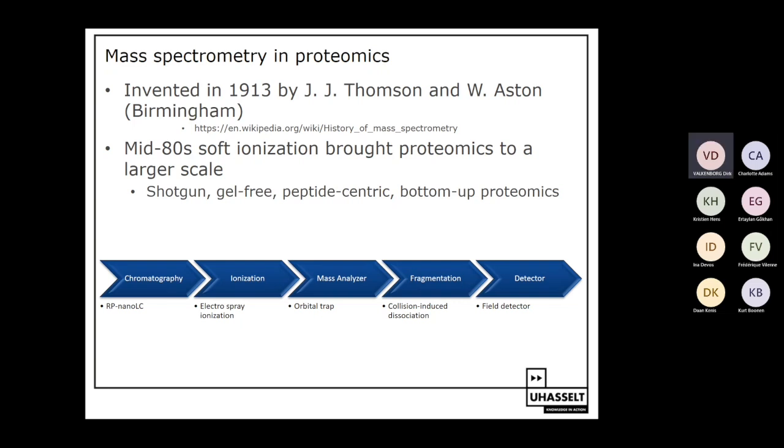And the soft ionization techniques that I'm talking about are MALDI ionization, discovered by Tanaka, and electrospray ionization, discovered by John Fenn, who passed away recently.